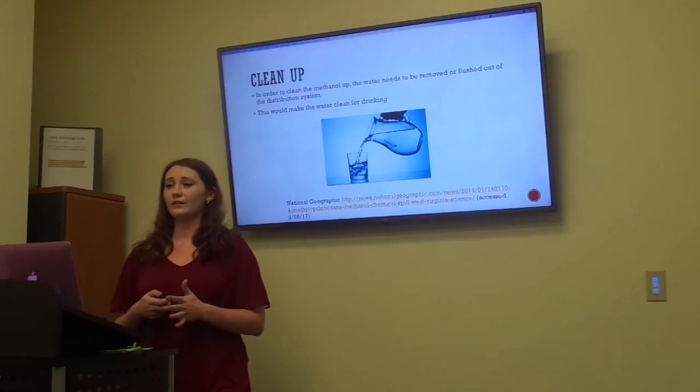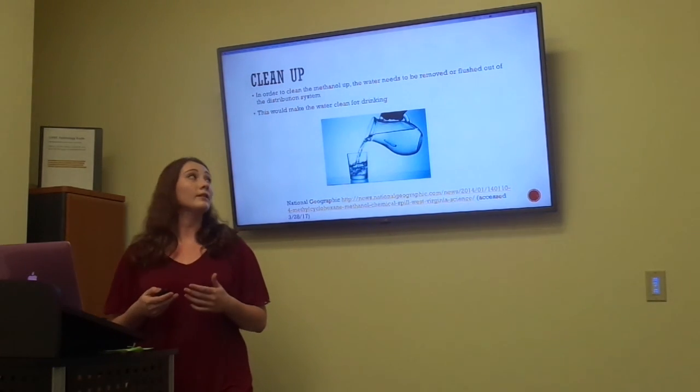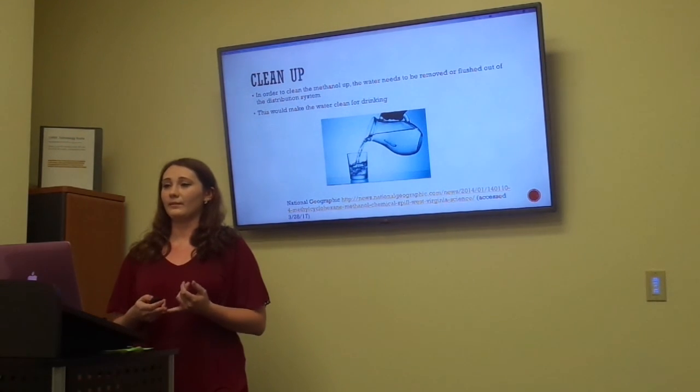So to sum this presentation up, we use IR and NMR to determine the unknown compound in the water, and those two things give us the functional groups, the types of hydrogens, and the ratios.